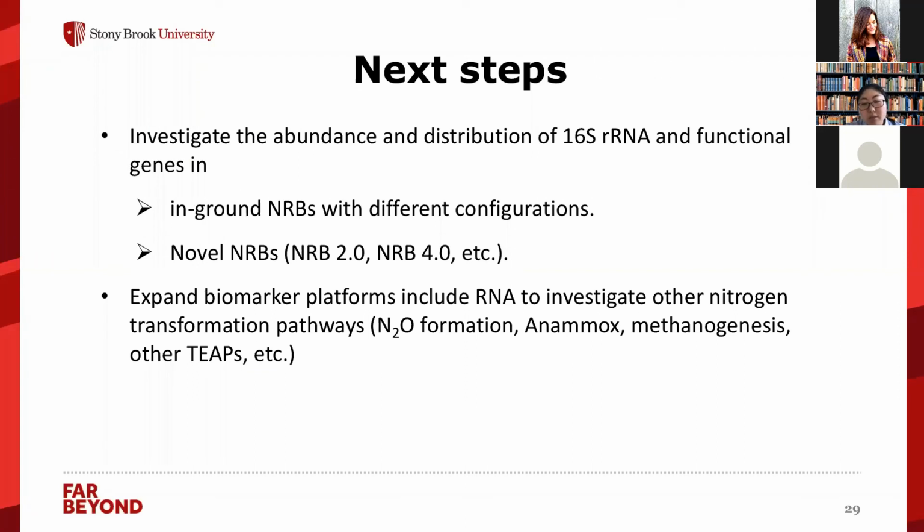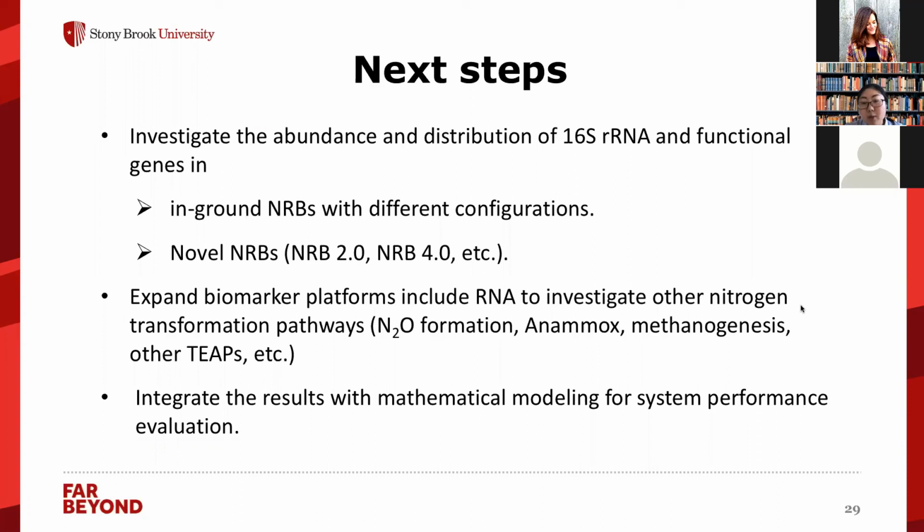Based on the solid foundation for nitrification and denitrification studies in NRBs, it will be easier to expand the qPCR biomarker platforms, including the RNA, to investigate nitrogen transformation of different pathways, like nitrous oxide formation. Nitrous oxide is a greenhouse gas and also an intermediate nitrogen product produced in the denitrification pathway. We'll combine the qPCR data with gas analysis to assess whether these biofilters completely transform nitrate to nitrogen gas. Finally, we'll also integrate the microbial data with mathematical modeling for system performance evaluation. With the help of molecular tools, we can definitely open the microbial black box in the NRB systems.